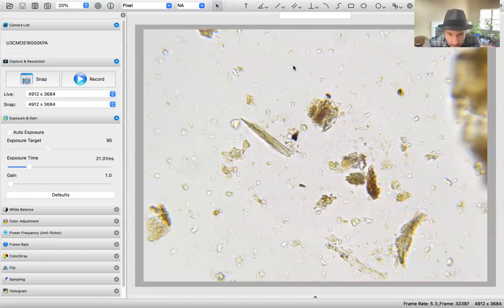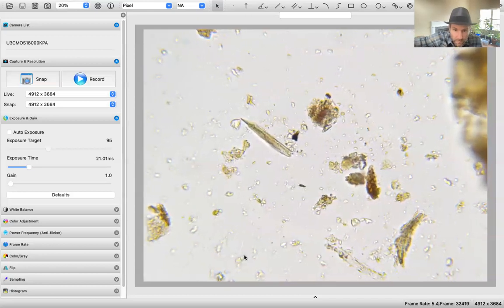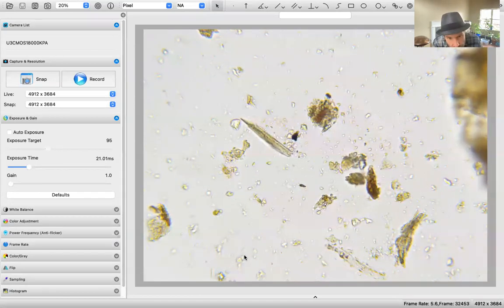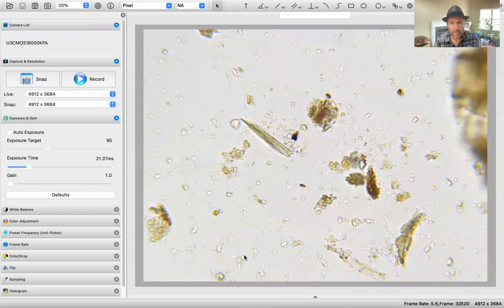Oh, nope, nope, nope. I see. There's no bend in it. That's actino. Or is it? Well, it's moving now. I think that was the lactobacillus. It's possible. It was hard to tell if it had a bend or not, but it's gone now.